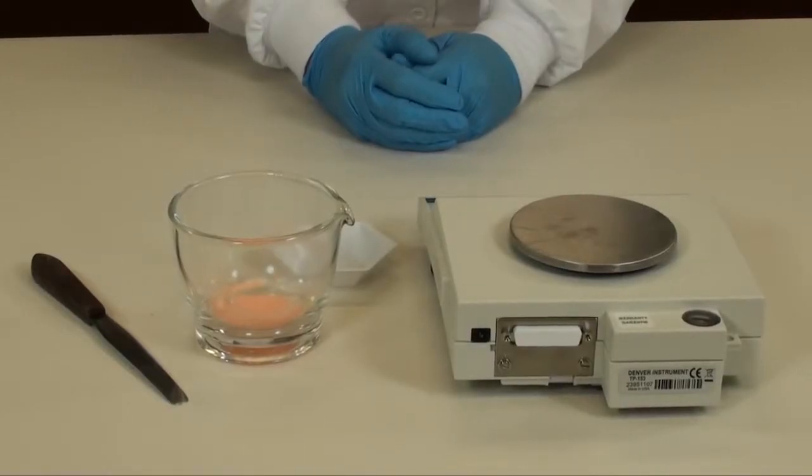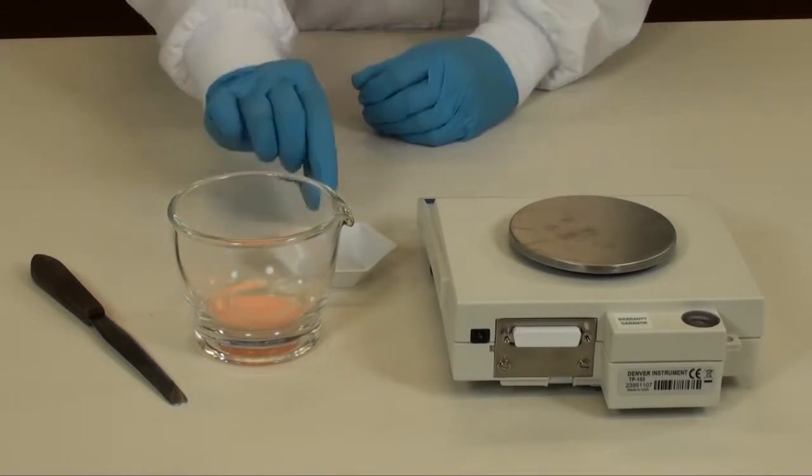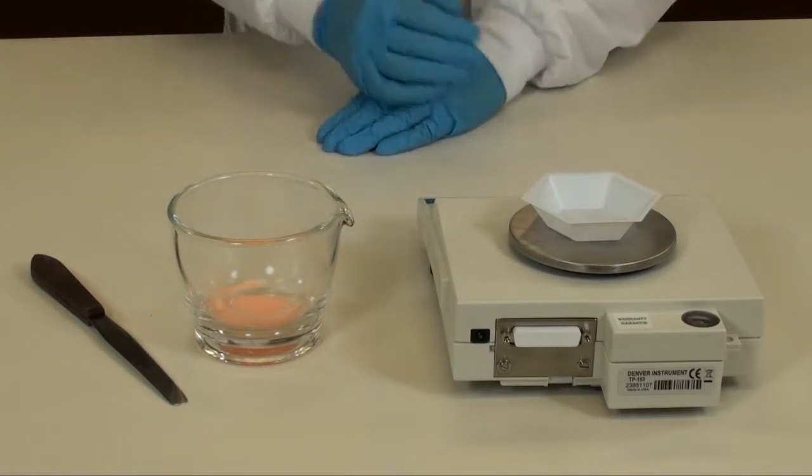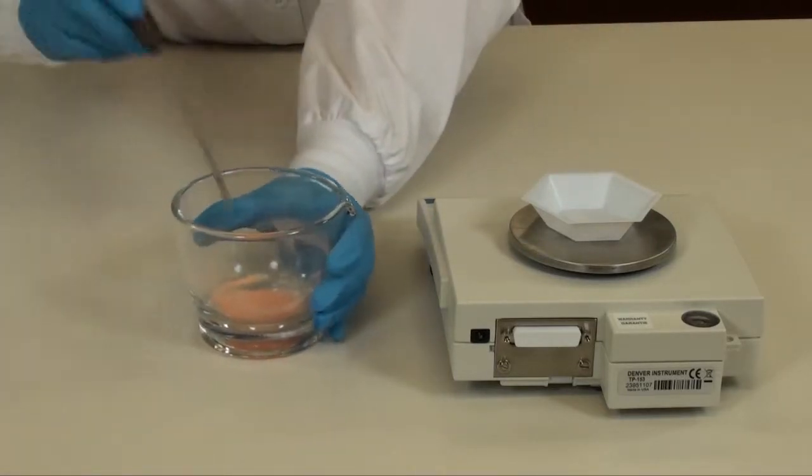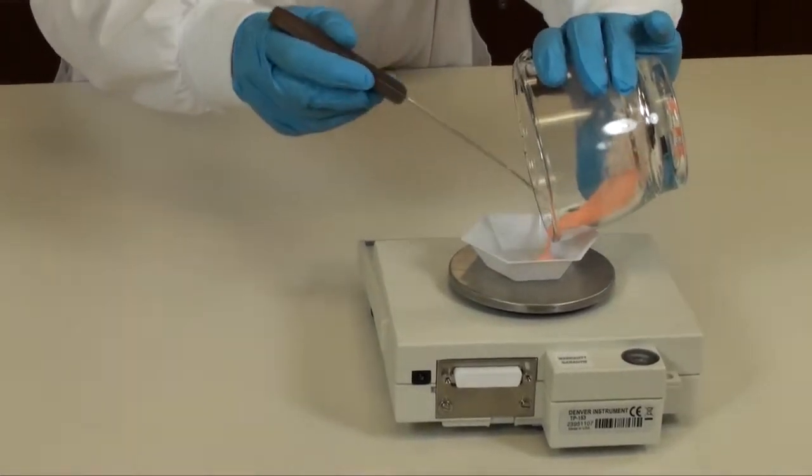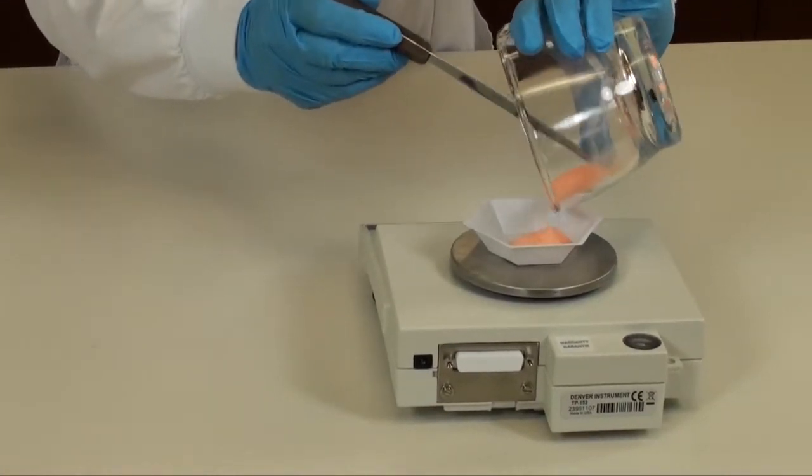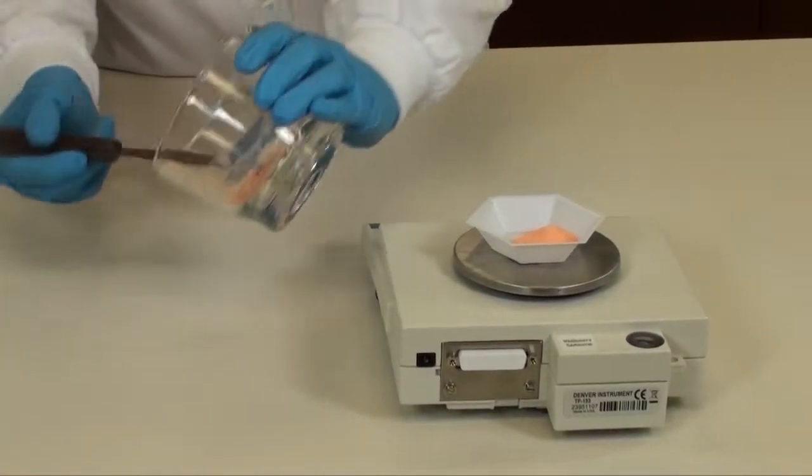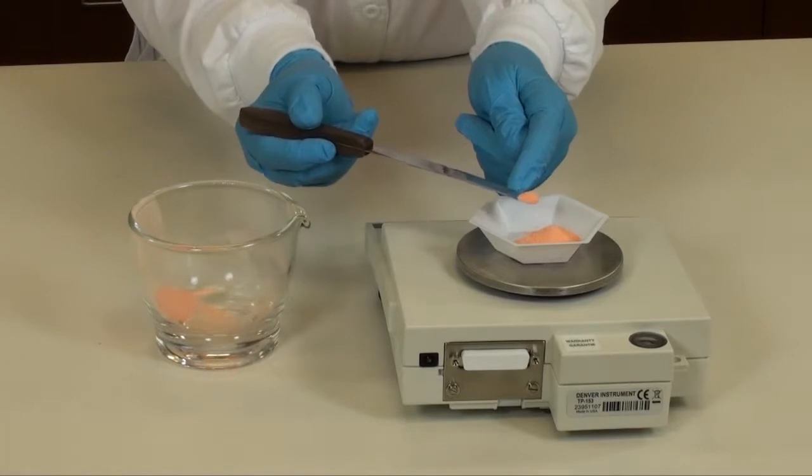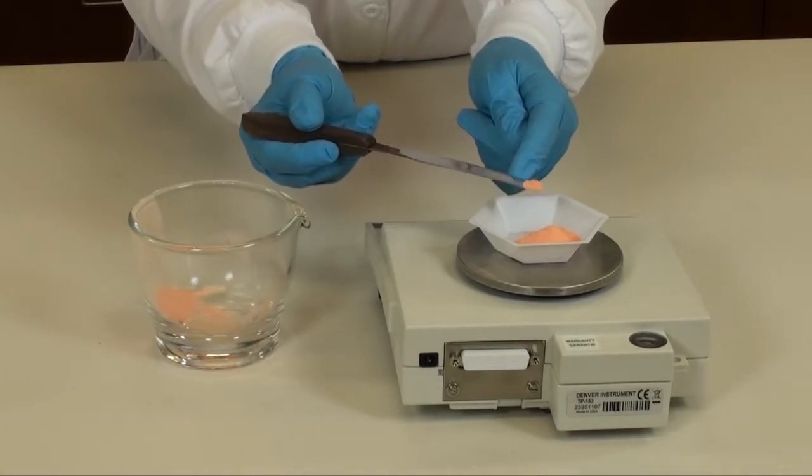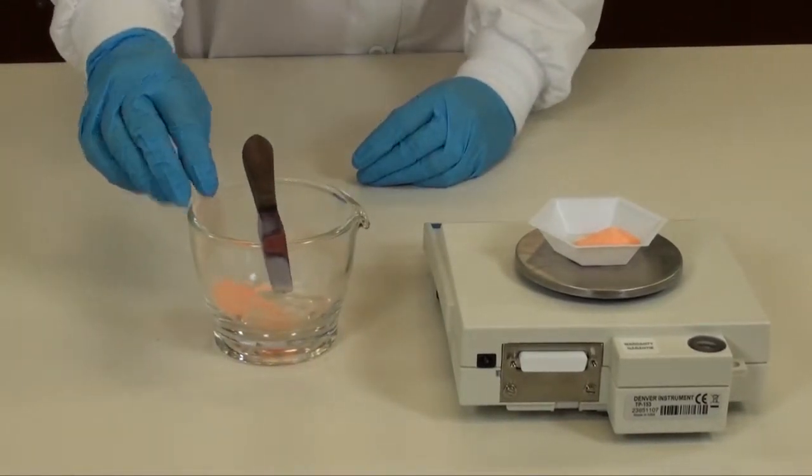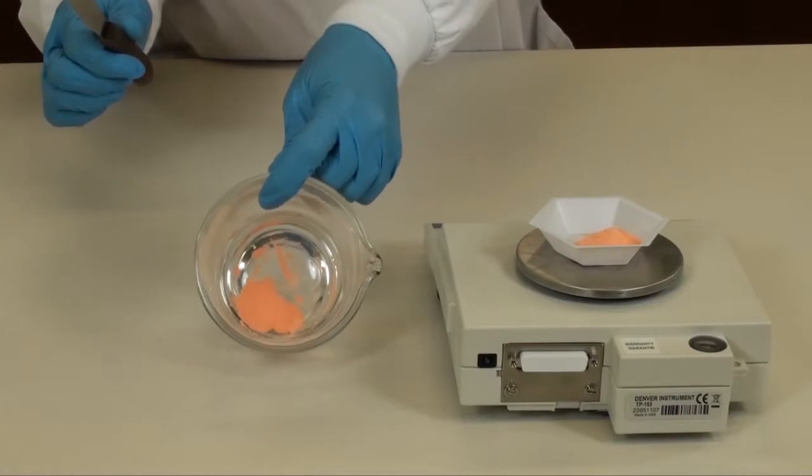You're now ready to weigh your crushed tablet allopurinol powder. Remember, take a medium weigh boat and tare your scale to zero and put the required amount of allopurinol powder into the weigh boat. When you get close to your target weight, gently tap some powder until you reach your target weight. Remember to discard the excess powder in the mortar appropriately.